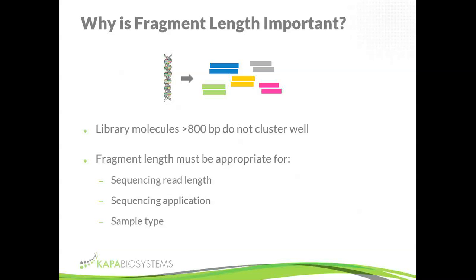Larger fragments are better than just a whole bunch of really small ones. And then finally, sample type. This is important in the clinical space. For instance, FFPE DNA, so DNA that comes from formalin-fixed blocks. The fixation of the tissue, as well as the extraction of the DNA, is pretty destructive. And so we end up with DNA that has a lot of molecular damage of all sorts. So we have oxidation and deamination and cross-linking and stuff like that.